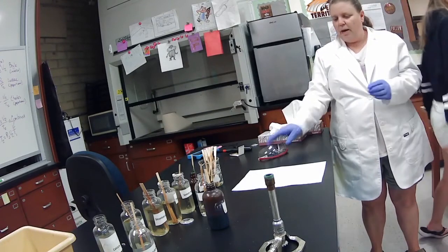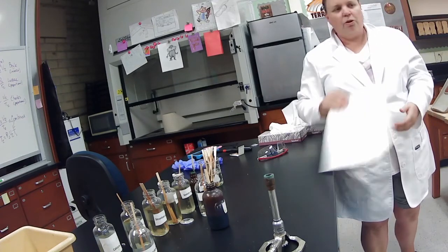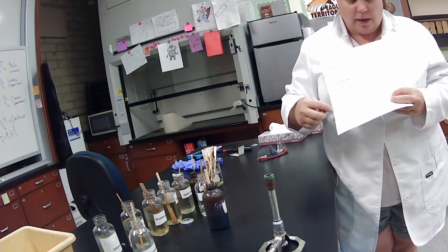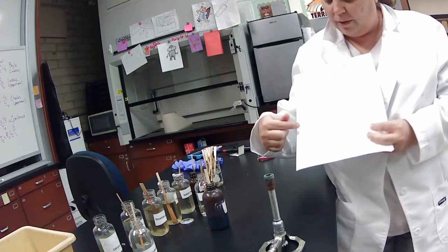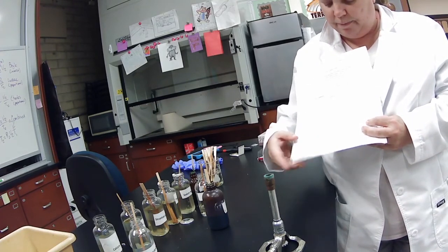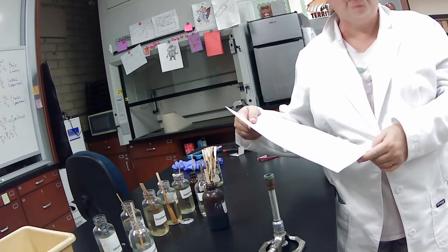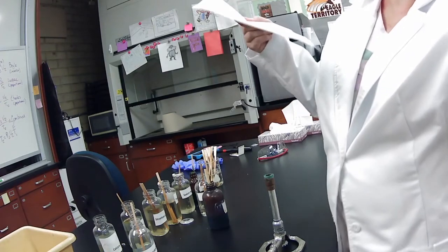Okay. All right. So now you should have, take off my gloves now I've burned everything. So you should have everything filled out in the top here. So you should have the flame color for all of them, and then you can list the flame color for A, B, and C. Then you're going to look up the wavelength, high or low, and you can pull that from your light and atoms packet. Okay, so your light and atoms packet, you're going to get your wavelengths from based on your color. Then you're going to tell me if it's a high or low frequency. It might be a medium. And then energy, high or low.